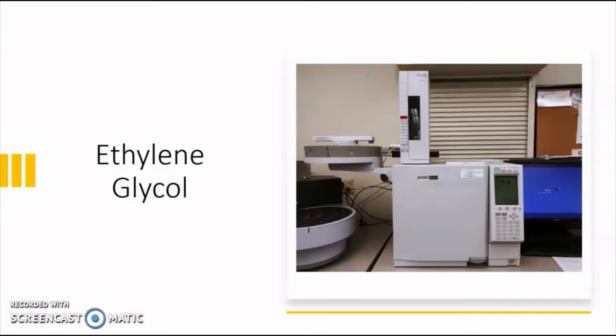And here is the Shimadzu 2010 GC that we're using for ethylene glycols. As you can see in this picture, the autosampler and injector are significantly different than that of the Headspace autosampler. However, the GC portions for both instruments are the same.